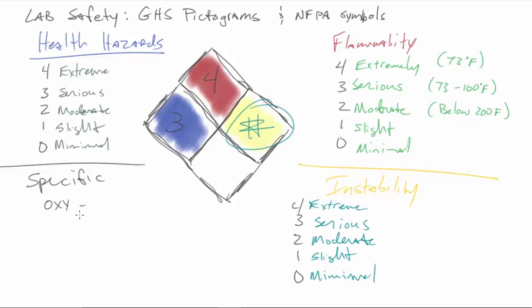We've got oxy, which means it's an oxidizer. It's going to help react some things explosively at times. Acid, goes without saying, it's an acid. Alkali, which means it's going to be basic, so it's going to be a base and react like bases do. Corrosive, something you definitely want to watch out for with this one. My acid and my alkali are also corrosive, but this means it's going to eat your skin, or it's going to eat the table or eat substances and kind of react them away.